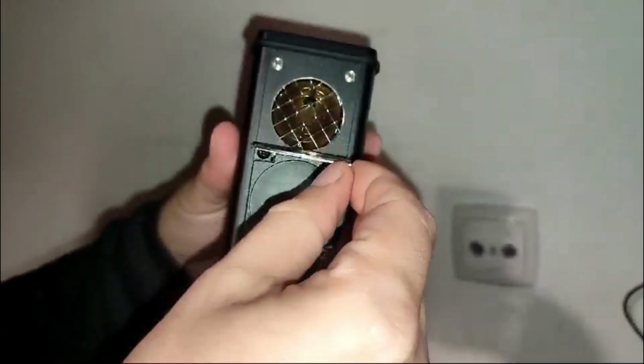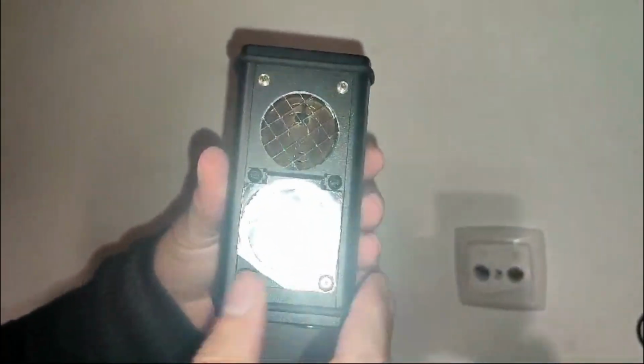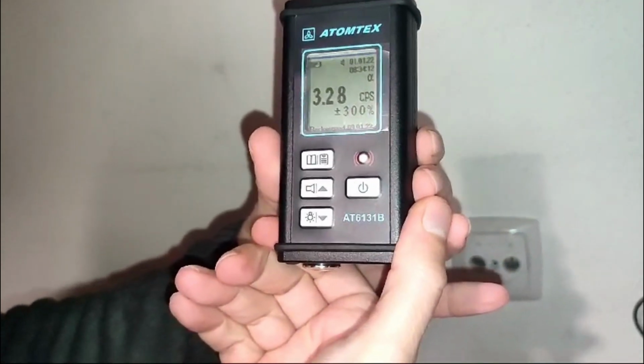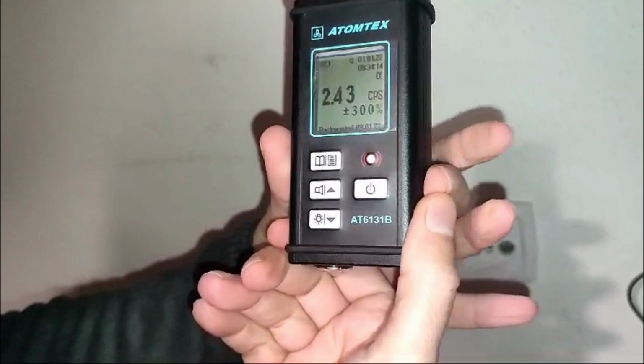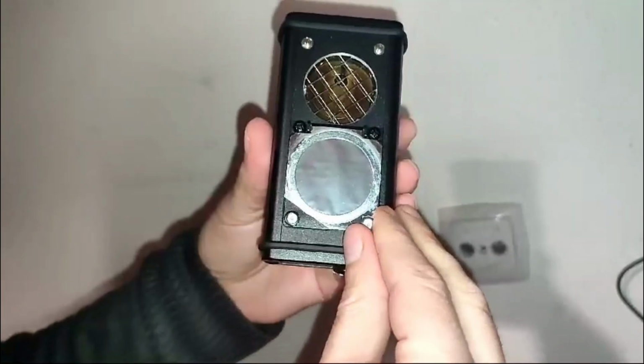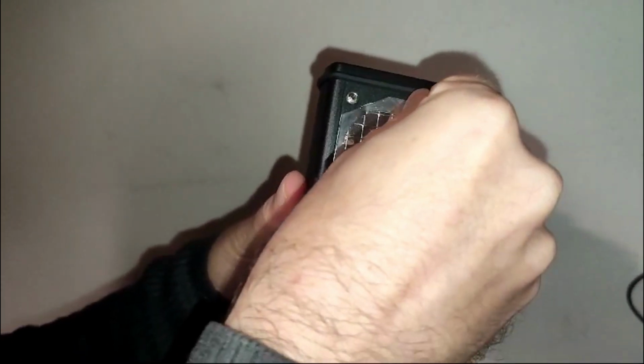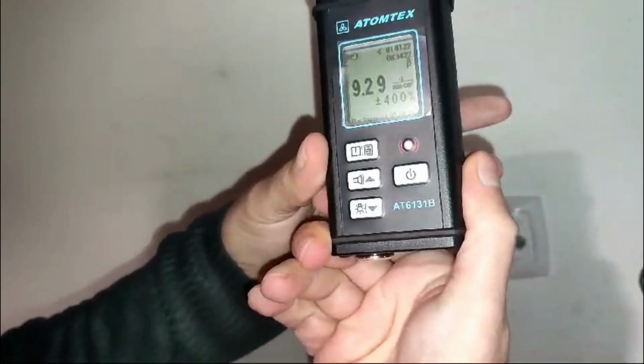And when changing the filtration from beta particles to alpha particles, the unit of measurement changes from flux density to counts per second. Therefore, the user will not measure the ambient dose equivalent rate for alpha particles, as they do not contribute to this quantity. Alpha particles are unable to penetrate the skin's outer layer of dead cells.